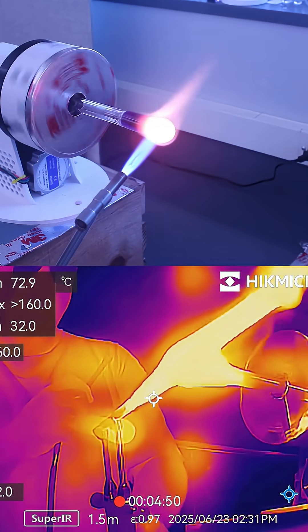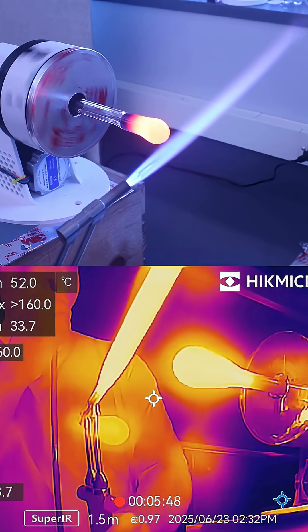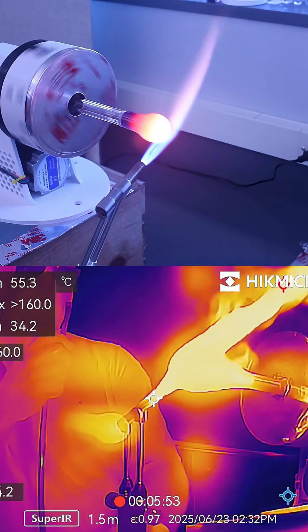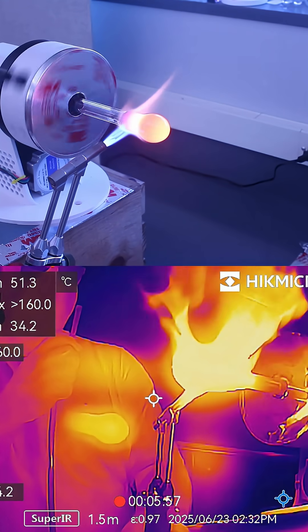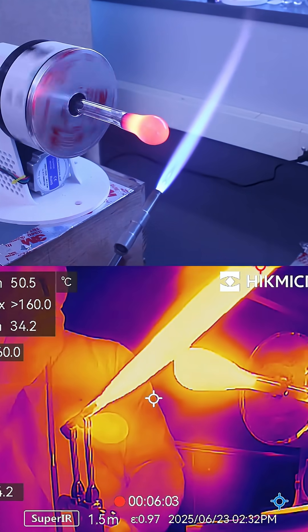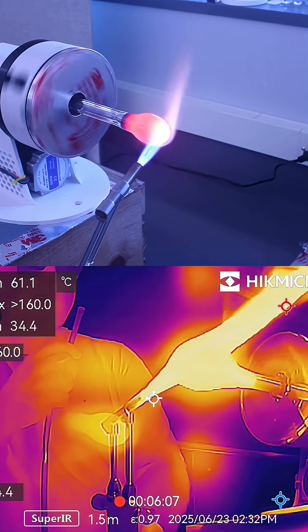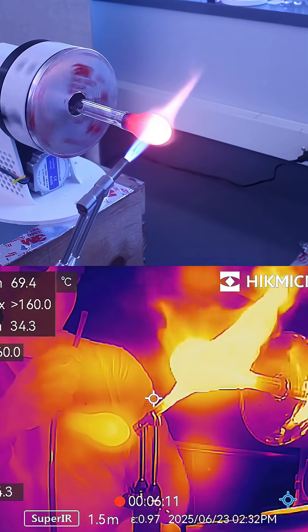I'm heating back here and then puffing just a little bit to widen that out. Kind of got it as an egg shape right now, which isn't bad.